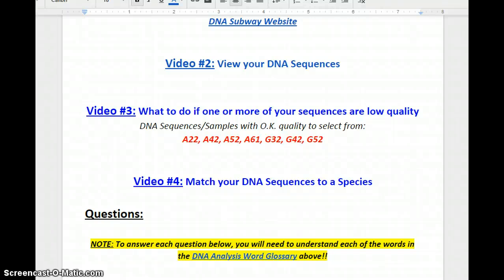This is the last and final video that you need to watch to understand how to use DNA Subway. This is video number 4, how to match your DNA sequence to a species.